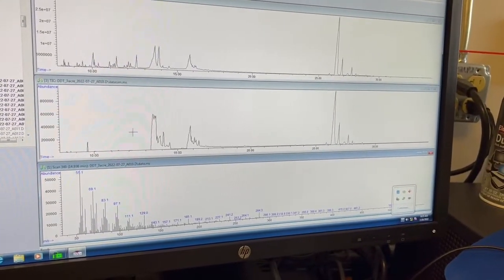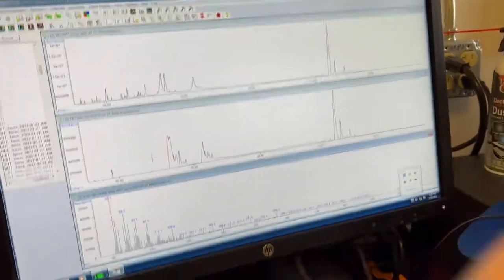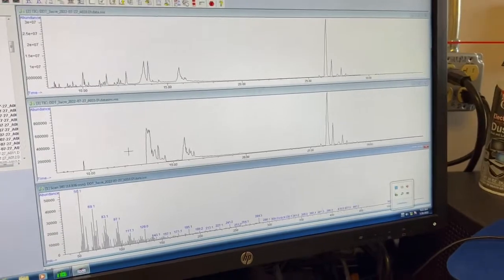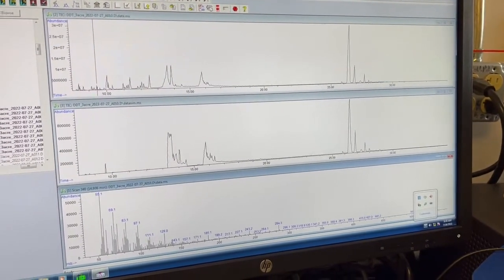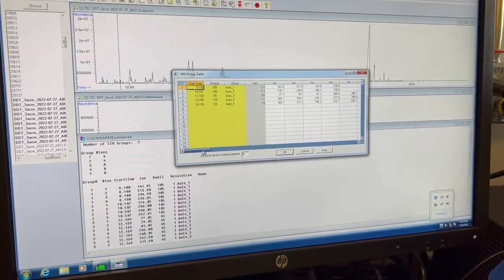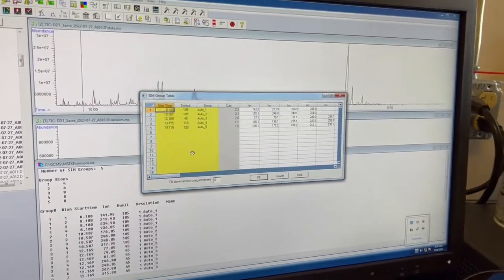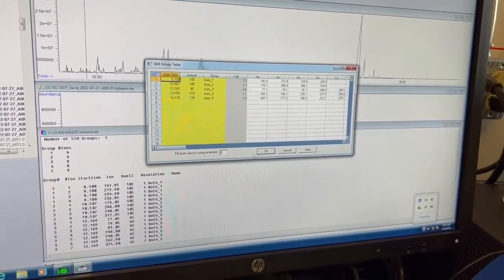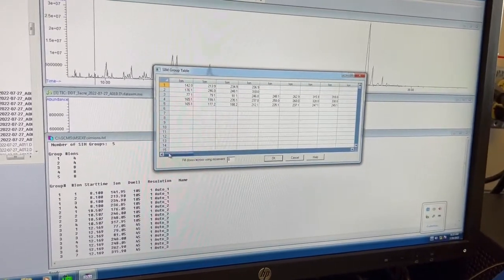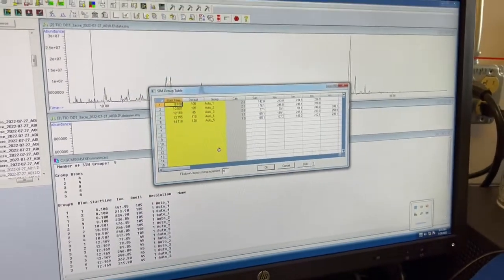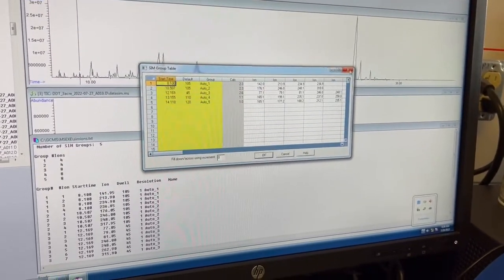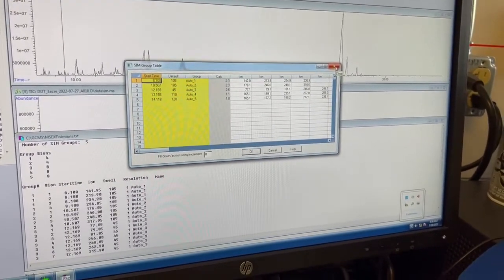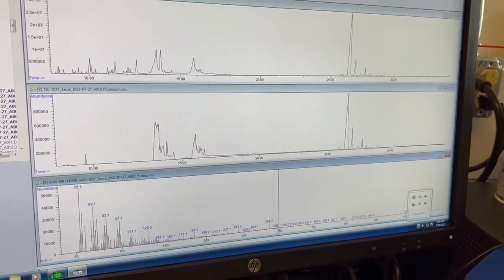And so simultaneously it also does what's called a SIM. That stands for Select Ion Monitoring. So as part of our method and our MS parameters, we told it what ions to look for at specific times. And so that's what they're printing out in the SIM. If you ever want to see what the SIM is doing, you can just kind of click on that. These are the different blocks. You can see at certain time points it starts looking for different ions. And the SIM is what we actually use to quantify your data.